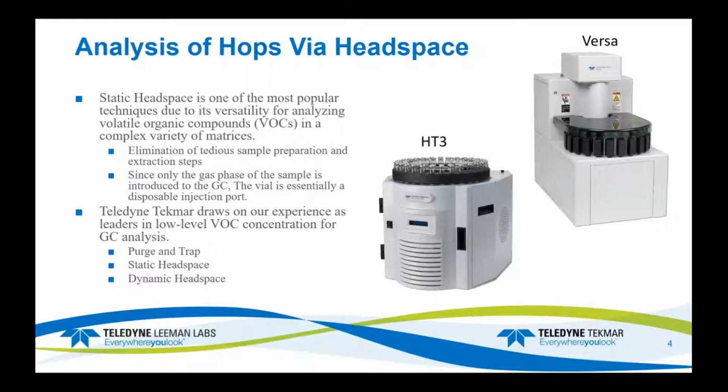Our analysis uses a static headspace technique, which is a very common technique for VOCs. It's pretty rugged. Basically, you don't have any problems associated with injection ports or column degradation because everything is done in a gas phase.